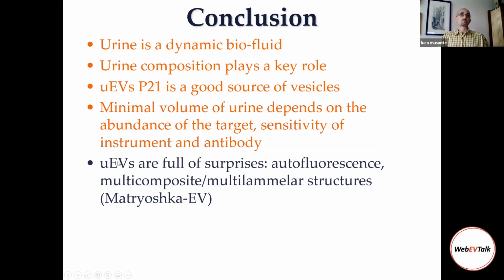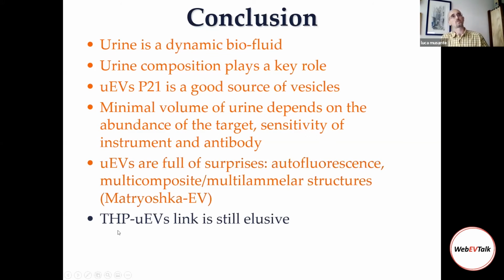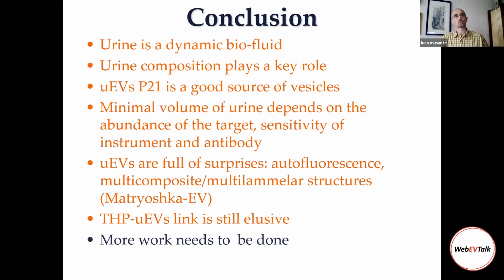Again, EVs, urinary EVs, or EVs in general, from any biofluid, from any cell culture media, are always full of surprises. Autofluorescence was a bittersweet pill to swallow. The multi-composite, multilamellar structures are amazing, and the nomenclature still has to find a name for those structures. Can be Matryoshka EV, Russian dolls, why not? The relationship between THP and EVs is still to be fully understood, and for sure more work needs to be done, and there is still a lot to study.